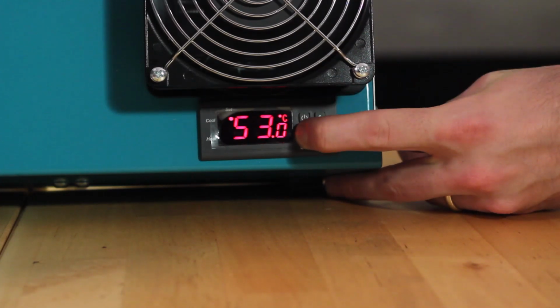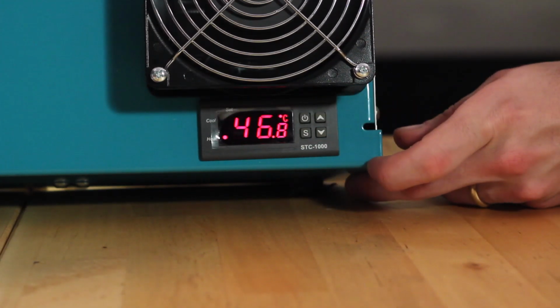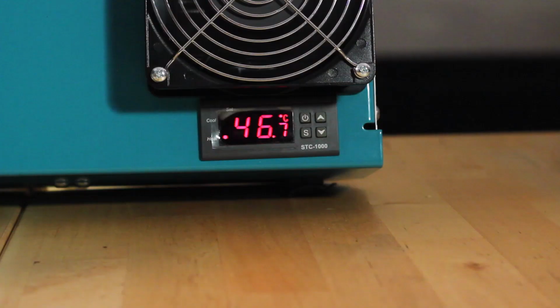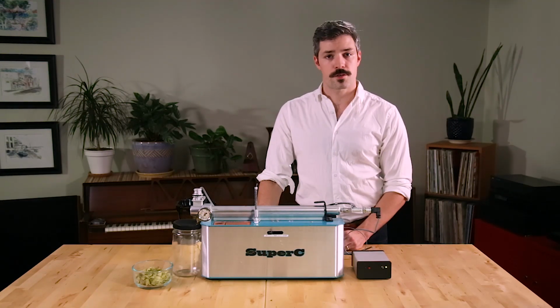Now that we've reached our setting, we release S and click the power button once to lock it in. If you ever need to check what the setting is, you can press the up key and it'll show what you have set the system to. Once we've set our temperature, we can then begin increasing the pressure to our desired pressure setting.